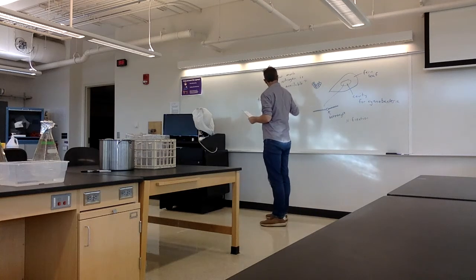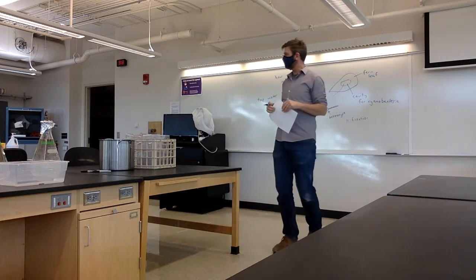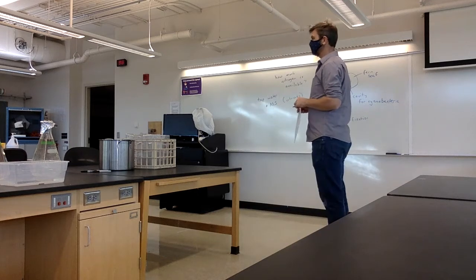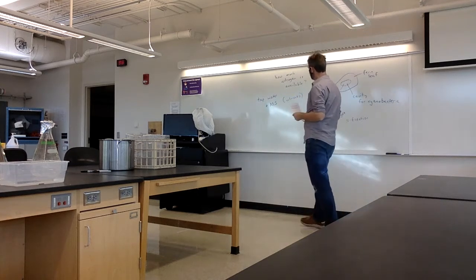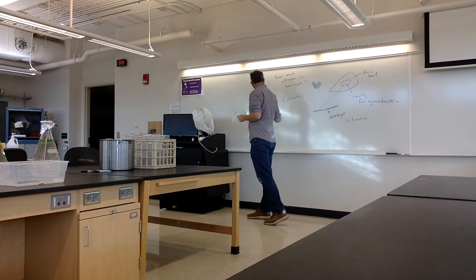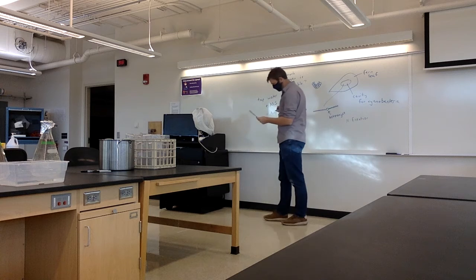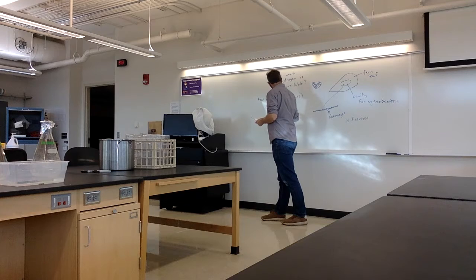So if the plants need more nutrients than they can get from tap water, we might see a difference in how well they grow if we add nutrients. Another addition is the addition of ampicillin, abbreviated AMP, and this is an antibacterial.